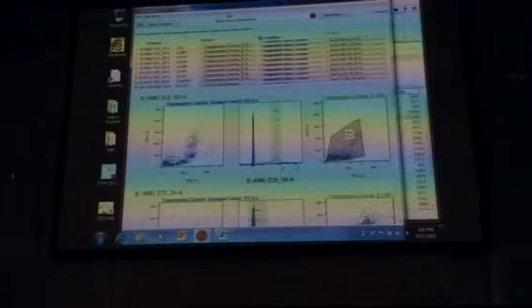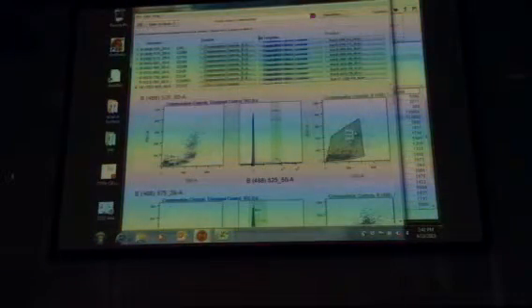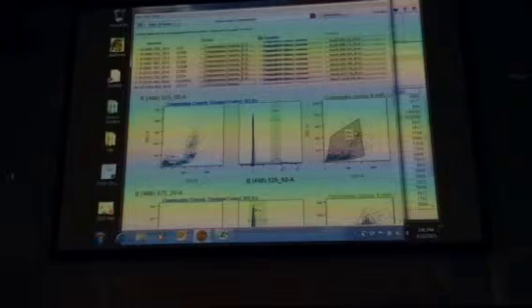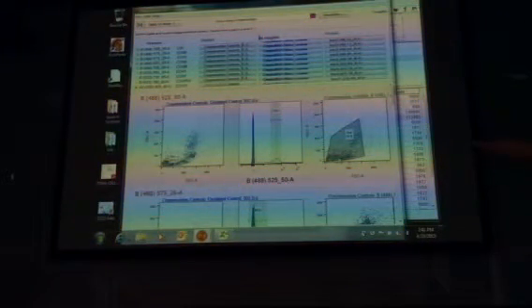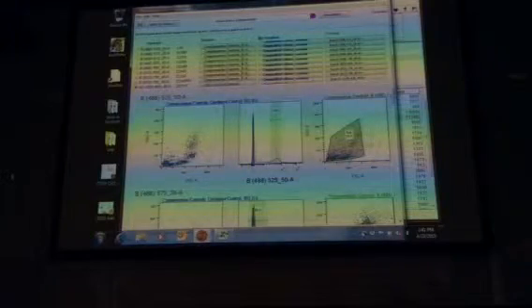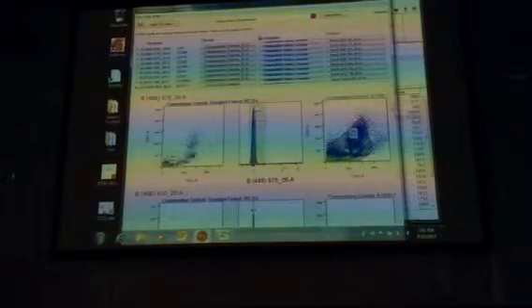So we gate all of the cells in the picture? So we gate all of the cells, like in that first one on the left? It's every, like the whole thing? Yeah, you want to gate on all of the cells here.